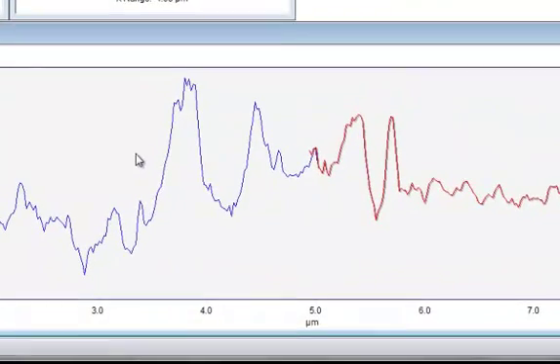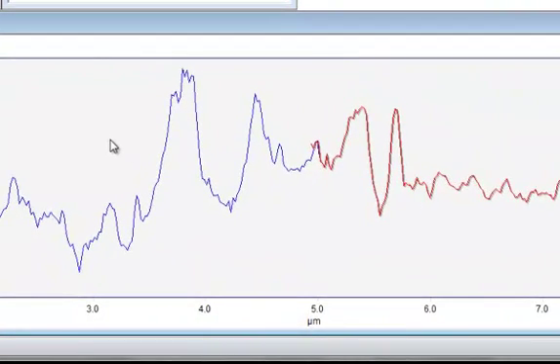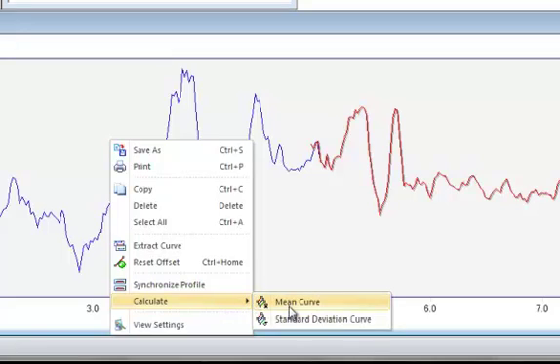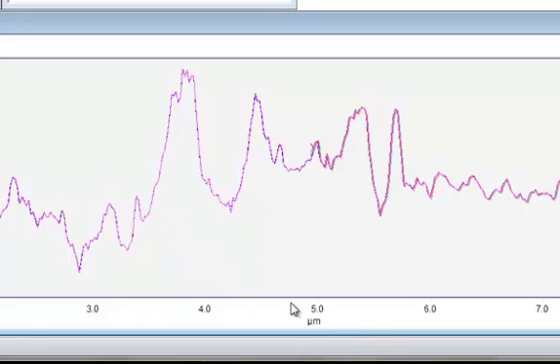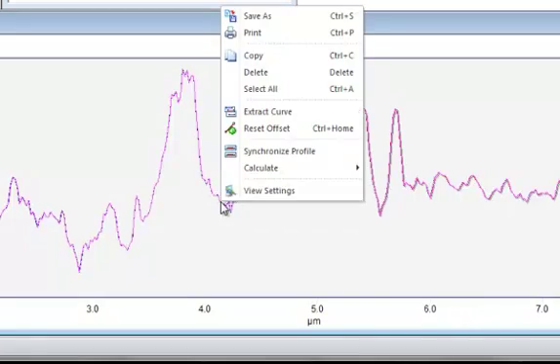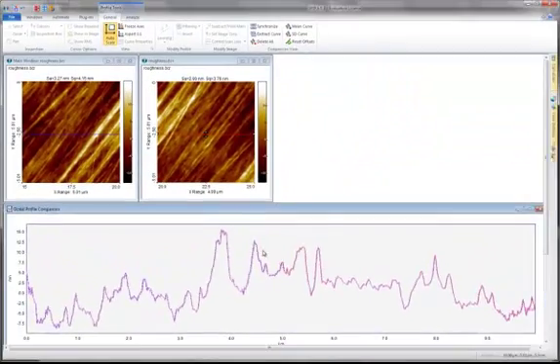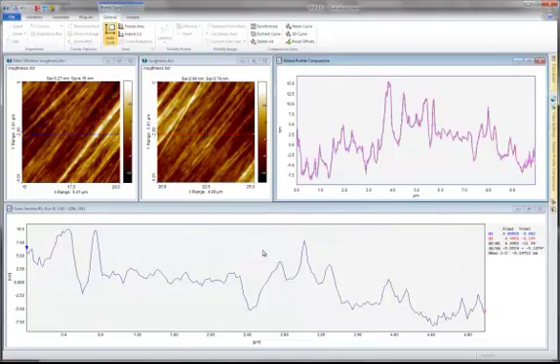To stitch the profiles just right click and calculate the average. Right click again and select Extract to push the calculated average profile to a separate analysis window.